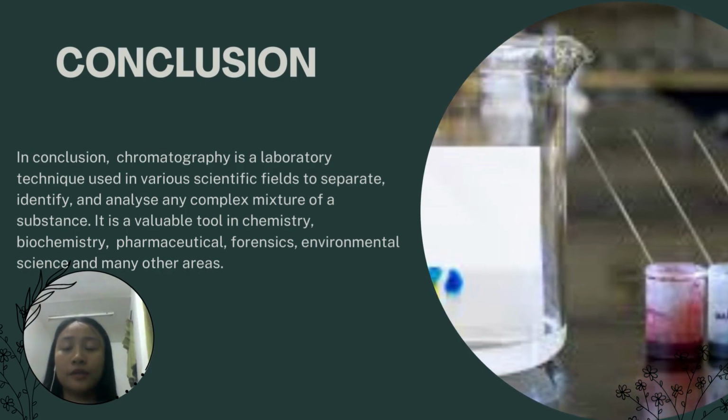In conclusion, chromatography is a laboratory technique used in various scientific fields to separate, identify, and analyze any complex mixture of substances. It is used in chemistry, biochemistry, pharmaceuticals, forensics, environmental science, and many other areas.